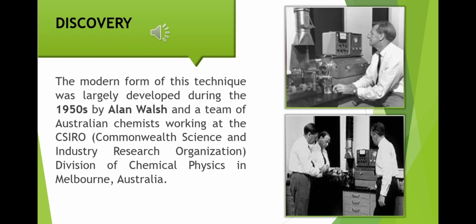The modern form of this technique was largely developed during the 1950s by Alan Walsh and a team of Australian chemists working at the Commonwealth Scientific and Industrial Research Organisation, Division of Chemical Physics in Melbourne, Australia.